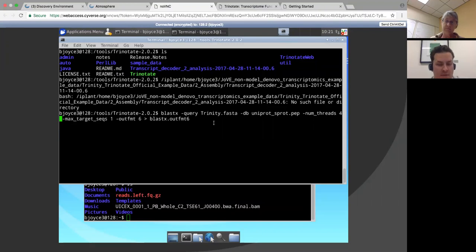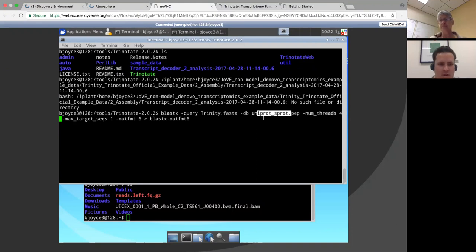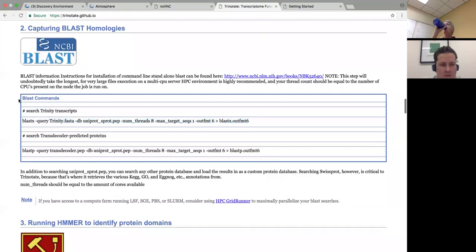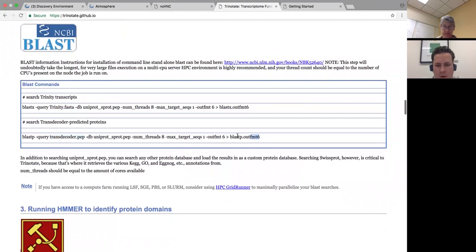I'm not going to run this because it will run for a very, very long time. Basically you set this all up, press enter, and it'll run. It will take all of those transcripts in this Trinity assembly and blast them against the UniProt database. That's going to go for a while because UniProt is huge — it's every known protein or every known nucleotide coding sequence. The only difference for BLASTP is that you use the peptide translation we got from TransDecoder. It will also output to a file for use later.